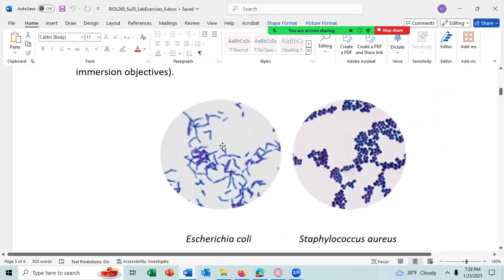So here, that's one cell there, and that's one cell there. This looks like it's actually 3 cells. One cell there, one cell there, and then one cell there. This one is actually 3 cells, one cell there, one cell there, and then one cell there. That's 2 cells, one cell there, one cell there.